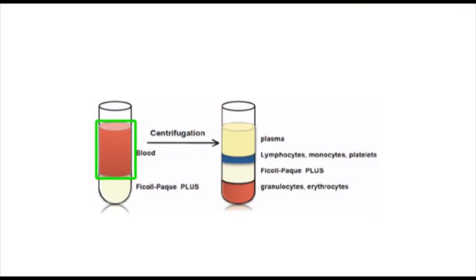The blood samples are layered over Ficoll solution and centrifuged for a short period of time. The cells in the blood samples will migrate differentially according to their density during centrifugation. Thus, different layers of cells will be formed. The lowermost layer will comprise mainly of erythrocytes which have been aggregated by the Ficoll. Just above the erythrocyte layer will be the granulocytes which have migrated into the Ficoll layer.